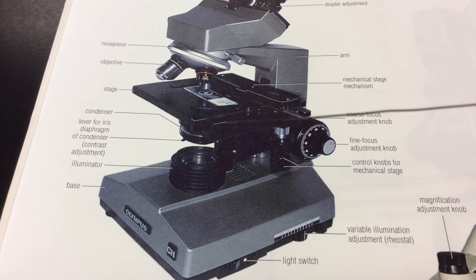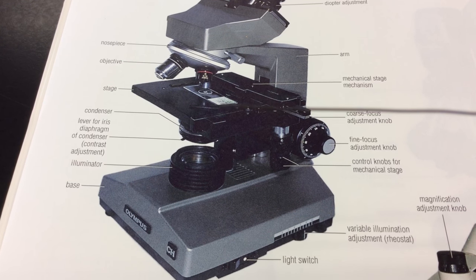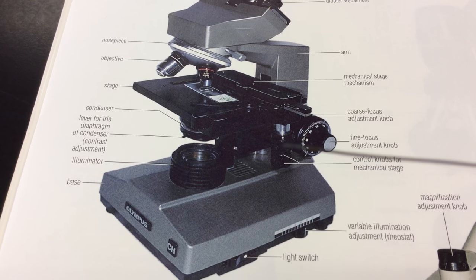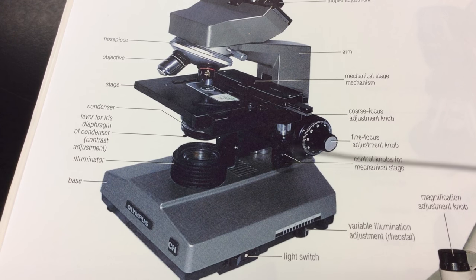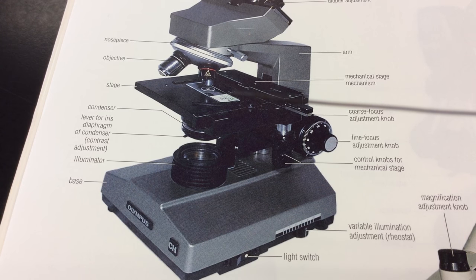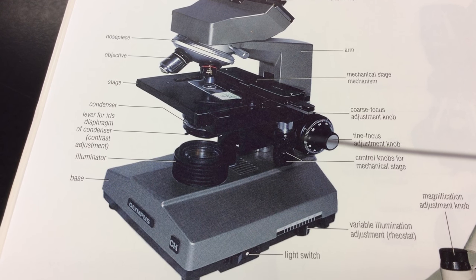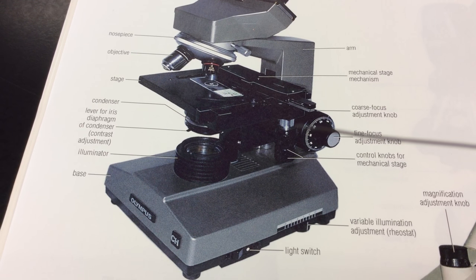And a huge advantage on our microscopes is we have a mechanism by which we can precisely move our microscope slides over the surface of the stage. And this mechanism is called the mechanical stage. And we'll see down below the stage, there are two knobs. These are the mechanical stage adjustment knobs. And by rotating these two knobs, we can move our slide forward and backward over the stage, or from right to left over the stage. So this permits us to precisely move our slide so that we can visualize many fields of view. We want to look at many fields of view of our specimen.